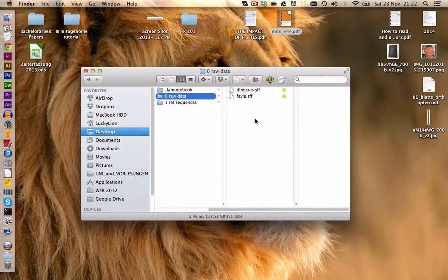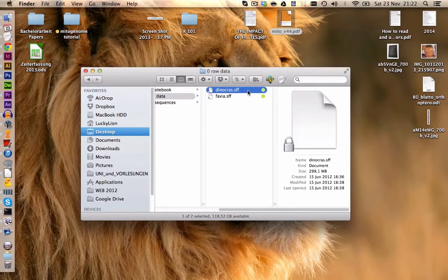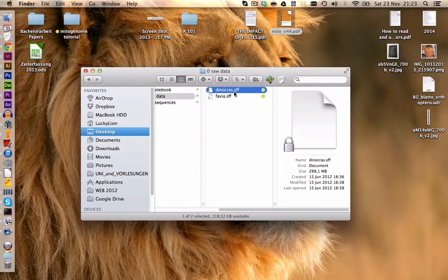But now let's get right into extracting our FASTA files from our SFF files. We have here our basic SFF files. SFF stands for standard flowgram format and we need to extract the information out of those raw sequence files.